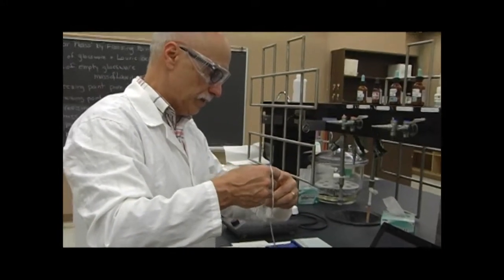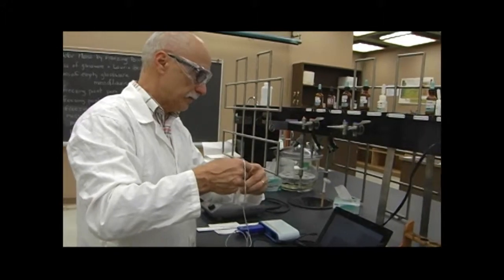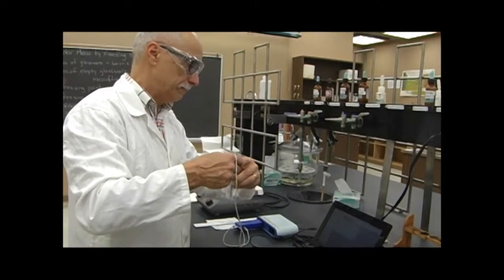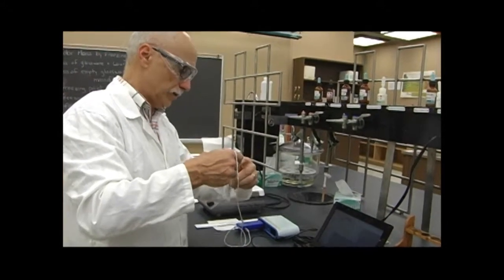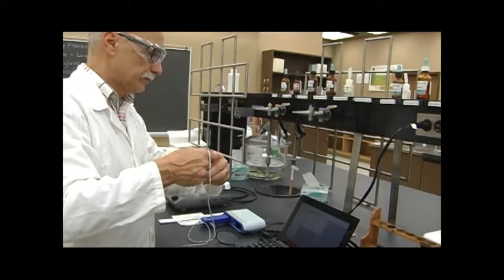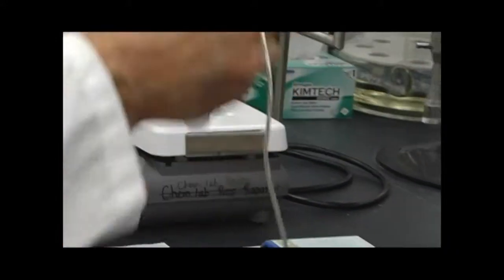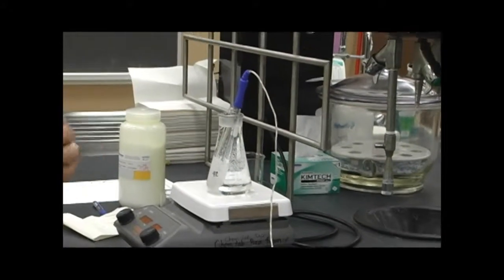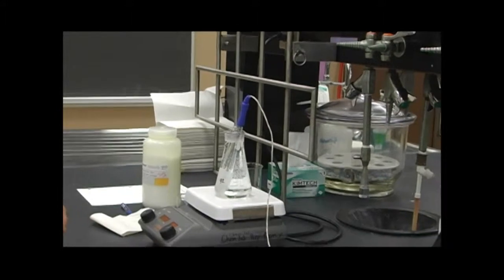And then when it reaches the time, I'm just going to click stop on the computer. And we're almost there. Just going to take it out of the jacket. And we're going to put it back into the water because we want it melted for when we add our unknown.